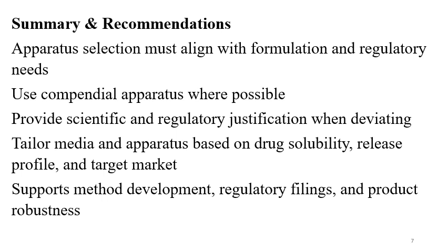Use compendial apparatus whenever possible. Provide scientific and regulatory justification when deviating from the standardized apparatus. Tailor media and apparatus based on the drug solubility, release profile and the target market. This supports method development, regulatory filings and product robustness.